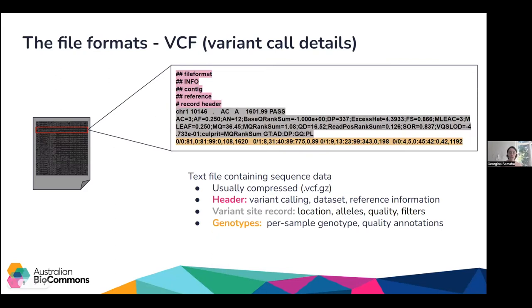The third file type is the Variant Call Format file — VCF — the product of variant calling. It's human-readable and divided into two main parts: the header, which contains information about how the file was generated, and below the header the actual variant information — a record for each variant position identified in the genome, with corresponding genotype data for each sample included. Some VCFs contain only one sample; others contain multiple samples. We'll talk about how to decide whether to generate a single or multi-sample VCF shortly.